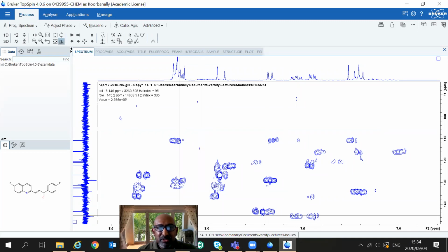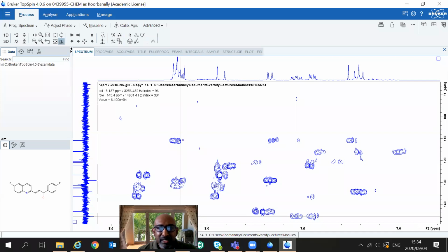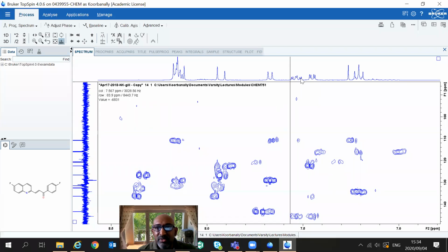I'm not going to concentrate so much on this because it's in this mesh and I can't see what's going on. But I'm looking at this around 140, 142 or maybe 144 or so. I'm looking at the singlet here, and you can see that it's correlating to that peak and that peak, which I know is that peak and that peak. The correlation I'm looking at now is a singlet correlation, which means it can't be this carbon here. Remember I said there were two NC carbons.